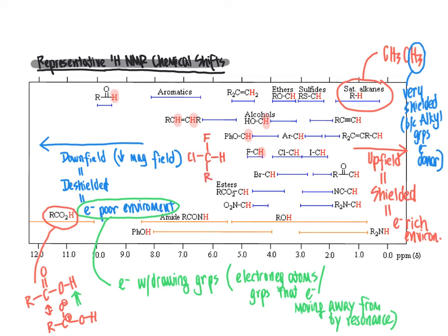So in the case of a structure like this, where we have not only a fluorine but also a chlorine, we would expect the chemical shift of this hydrogen that I'm circling with my laser pointer to be somewhere here downfield. I can't tell you exactly where without doing a measurement, but I'm guessing somewhere in this region of the blue bar that I have plugged in here, we would expect that signal to show up because there is not just one, but two electron withdrawing groups directly bonded there.